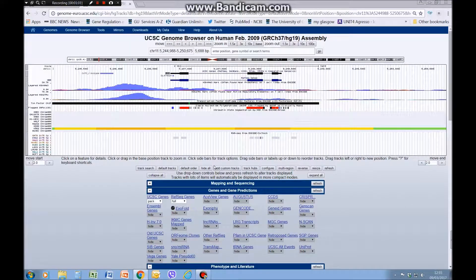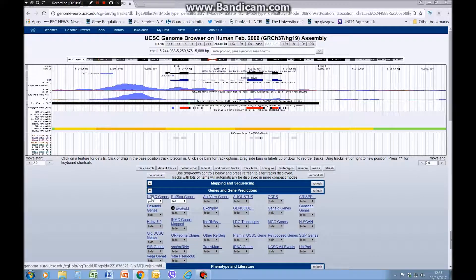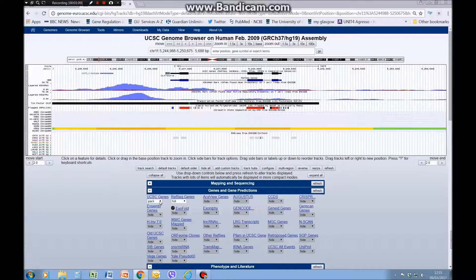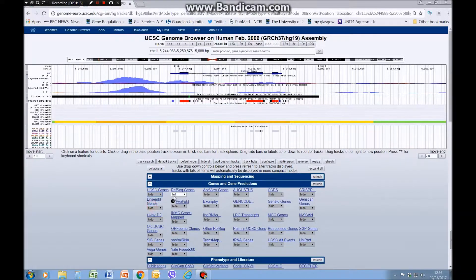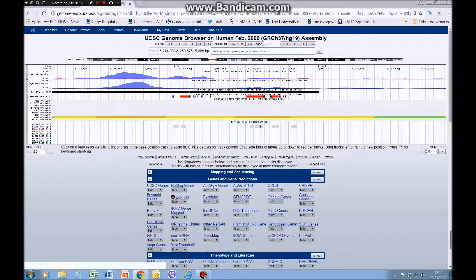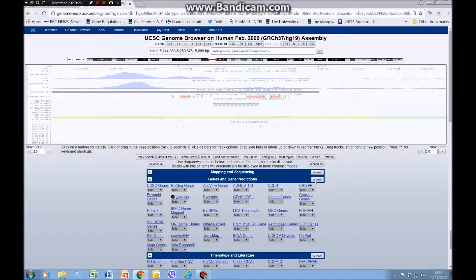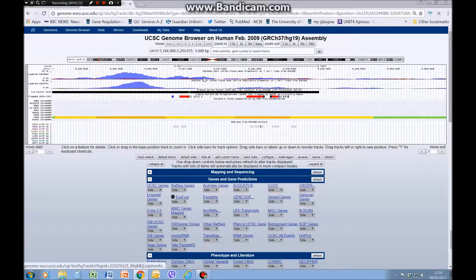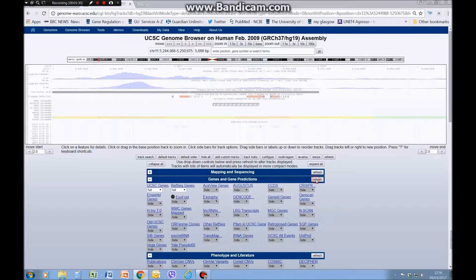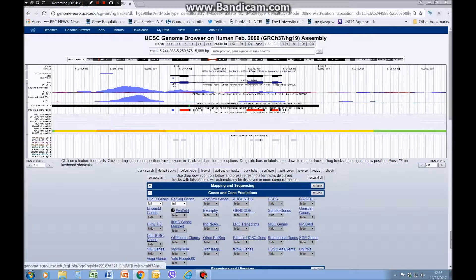To get your gene to show, we're going to use the track sets UCSC genes and RefSeq genes. By clicking the little arrow here you get different viewing options: hide, dense, squish, pack, and full. I'm going to click hide and then refresh — as you can see, both of those gene tracks have gone. We can view them again by going to full and clicking refresh, and there it is back.